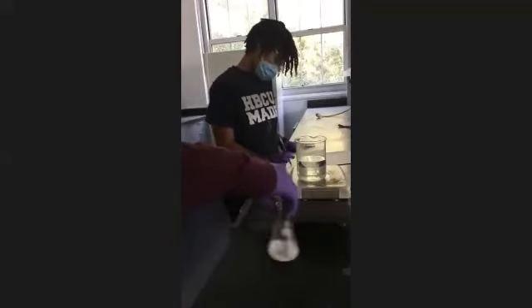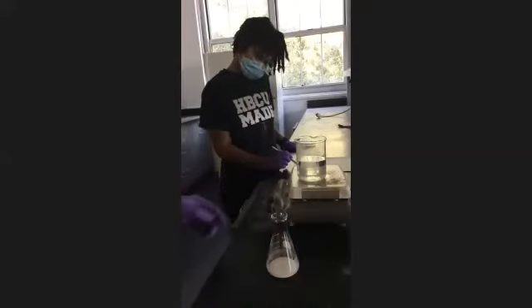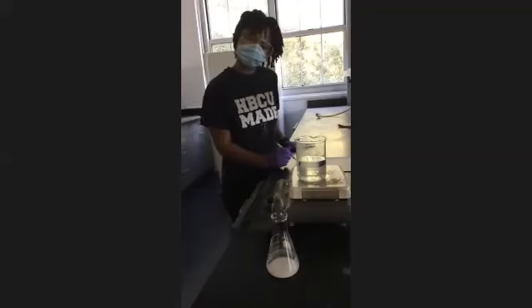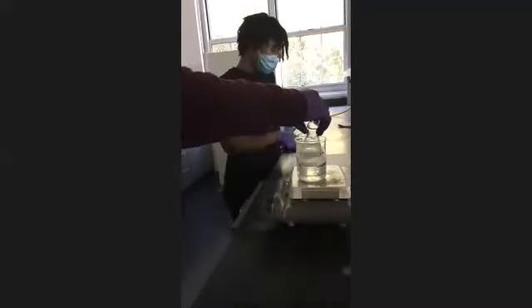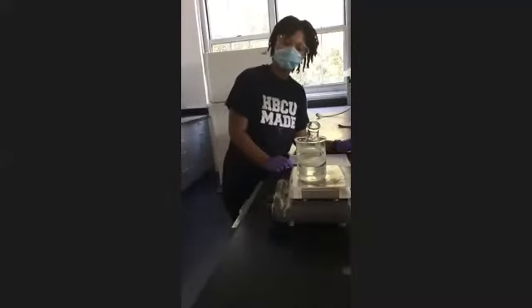Okay. All right. So now, once we've added the acetic anhydride and the sulfuric acid, we're going to take this flask. You want it to stay hot. If it cools off too much, it won't dissolve. The reaction won't go. So we're going to add it right to the water bath, sit it down in there, and heat it until it goes clear.